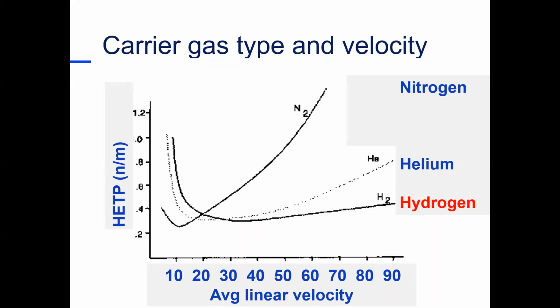Again, you can't get helium very easily. So what do people do? They use a different gas. So what do you want to use? What's a better choice than helium? Well, here's nitrogen. We want this to be minimum. The lower, the better. And nitrogen looks really good. Look how low that is. That's lower than this or this. This is our best carrier gas to use, most efficient.